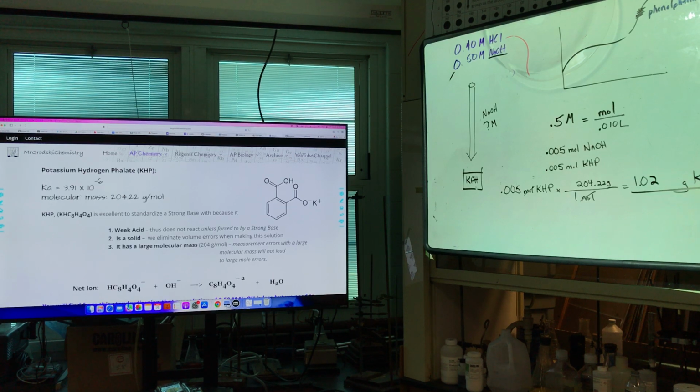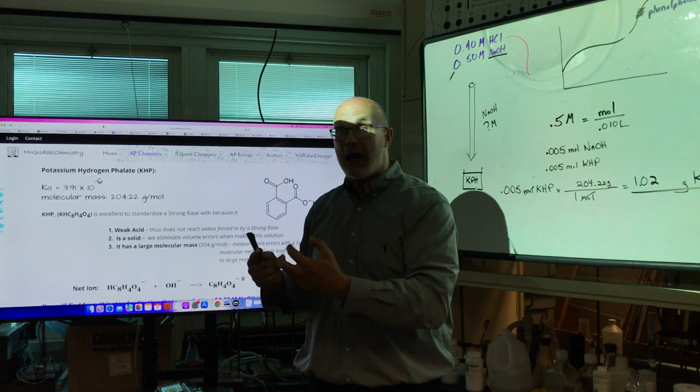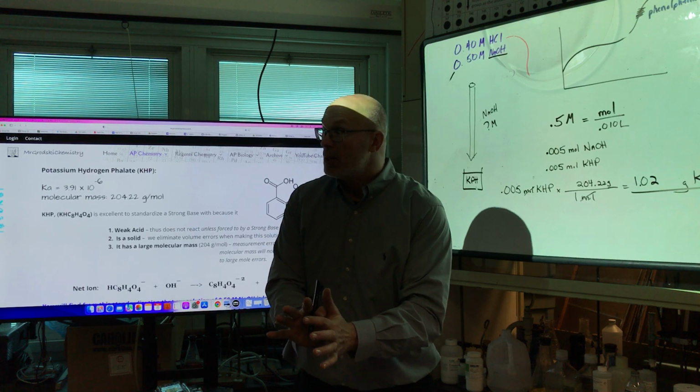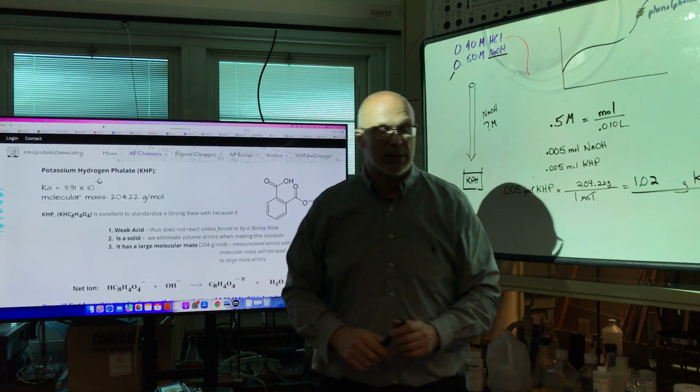All right, so that's the explanation of how to make the solutions and why we standardize. Because my strong base is going to react with what? Everything else. I got to figure out what it is today to know what? Exactly what my tablets are today. All right?